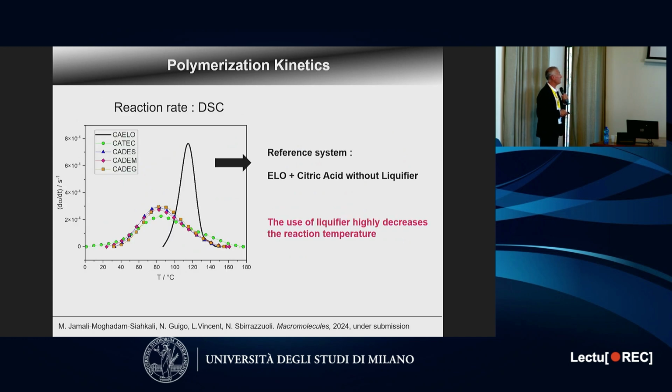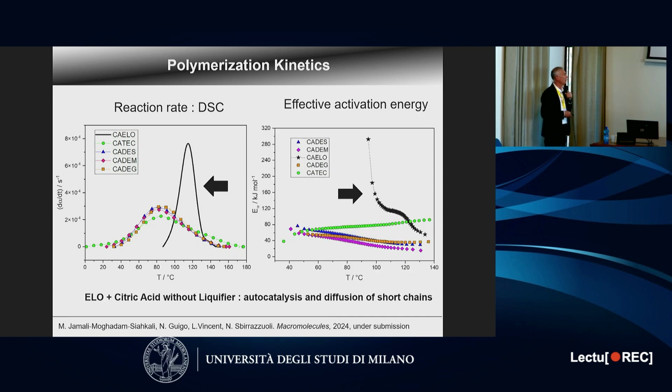And now we can compare this value with the reference system. The reference system is done with ELO and citric acid, but without liquefier. And what we see is that the use of the liquefier highly decreases the reaction temperature. So this is very interesting because with the liquefier, we decrease the viscosity and we decrease the reaction temperature. And for industrial application, these two parameters are very, very important.